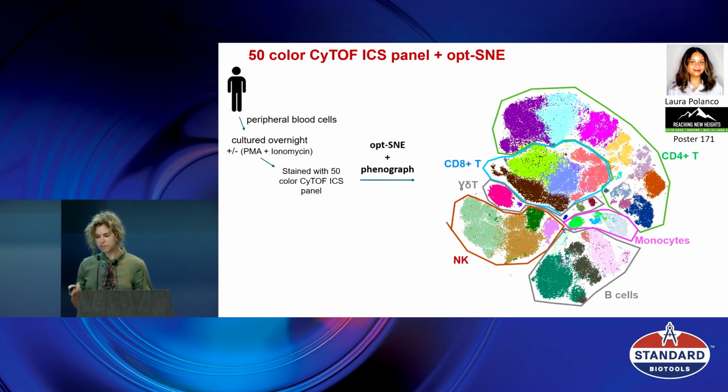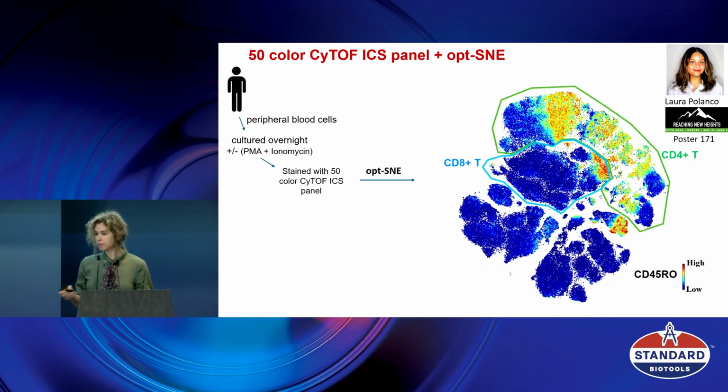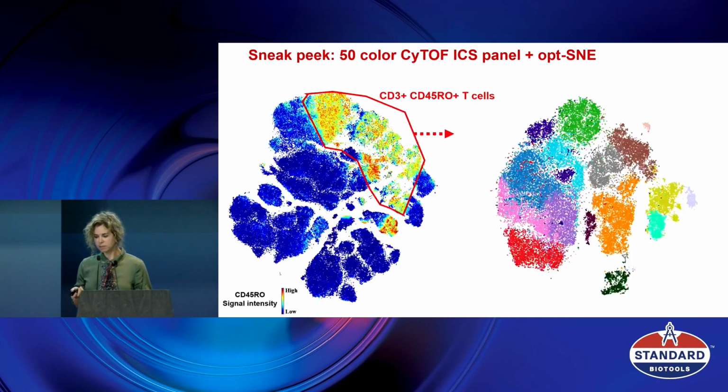So specifically for this talk, I wanted to pull out the T cell memory, because these are the cells that we expect to produce biologically relevant cytokines. Our stimulations are also kind of artificial. They show what the panel is capable of, but biologically relevant are just the cytokines that are produced by memory cells, right? So I pulled out the clusters that correspond to CD45RO positive T cells.